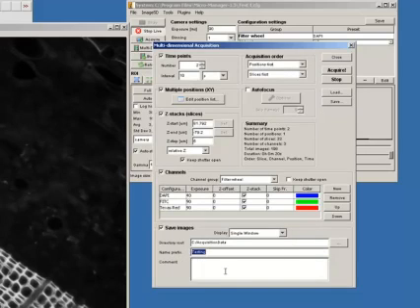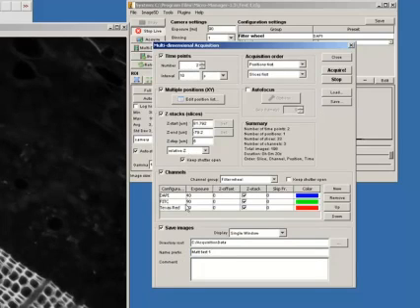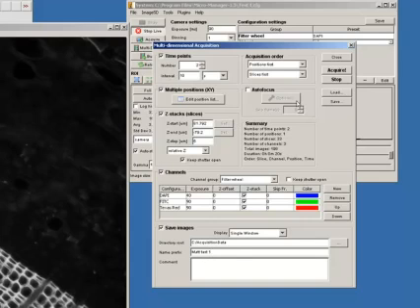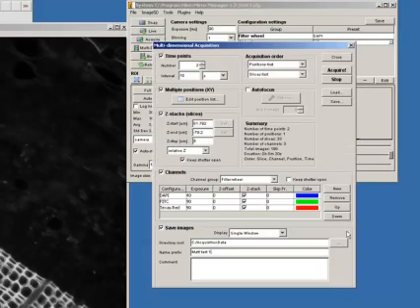And let's give this one a name. And we're going to call it Map Test 1. So, we're happy now. We've got two time points. We're going to take multiple positions. We're going to take a Z stack for each of the channels. We're going to keep the shutter open. I've got my three channels selected. And I've selected where I'm going to save the images. So, once we're happy. We can just start the acquisition.